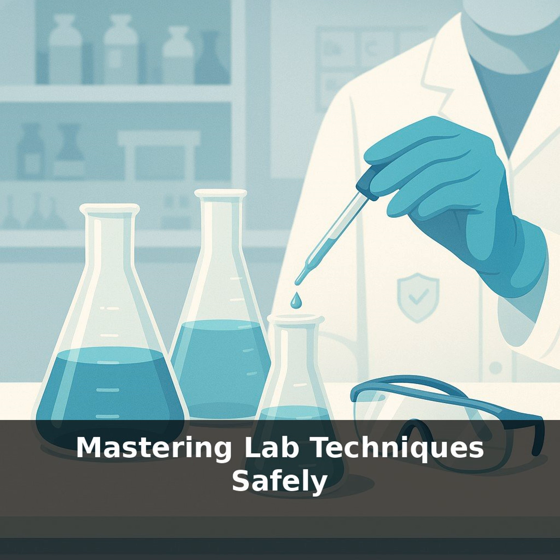With that foundation of safety as professional respect, here's the framework to carry forward. Pause, protect, proceed. Pause to scan for hazards. Protect with the right PPE and protocols. Proceed only when your equipment and setup match the risk. Picture that student again. Now they stop, gear up, reroute cords, and adjust their setup before reaching in. That tiny reset turns a near miss into a non-event.